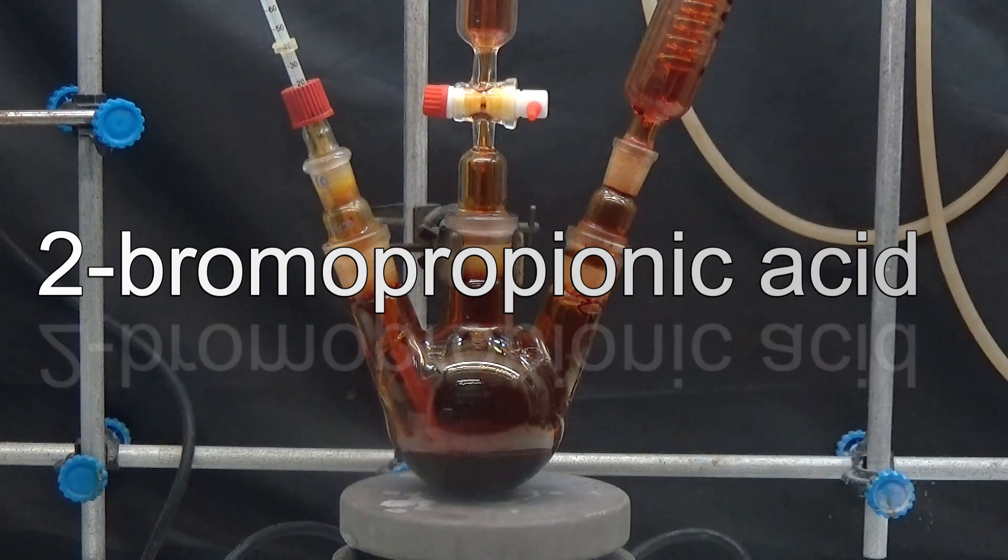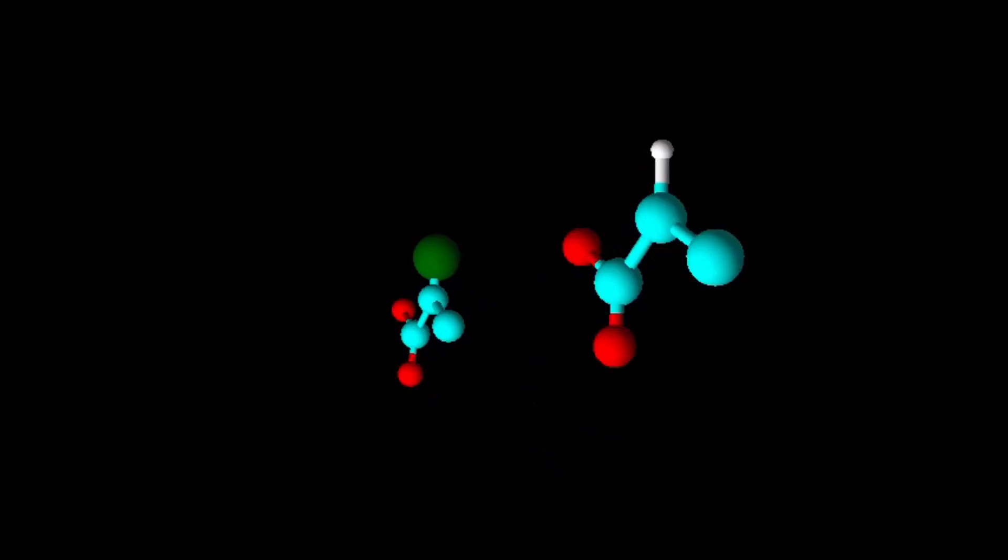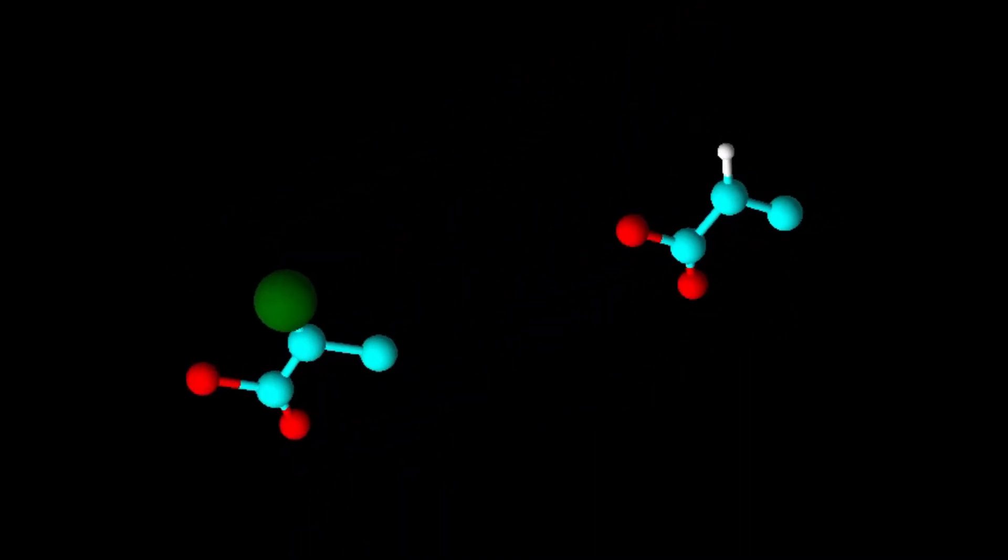In this video, we will learn how to obtain 2-bromopropionic acid. 2-bromopropanoic acid is obtained by introducing a bromine atom into the alpha carbon and replacing it with hydrogen.